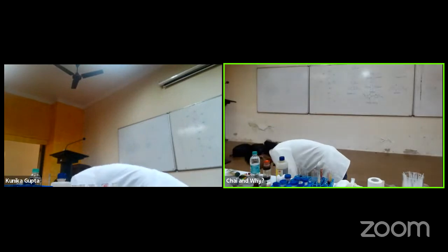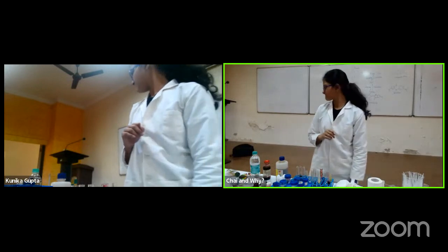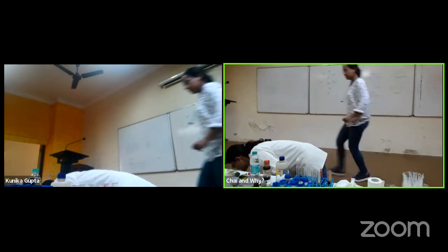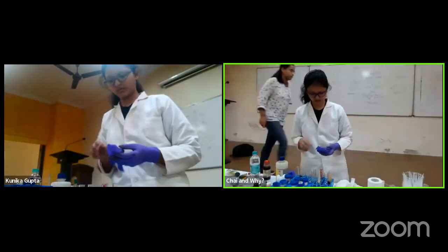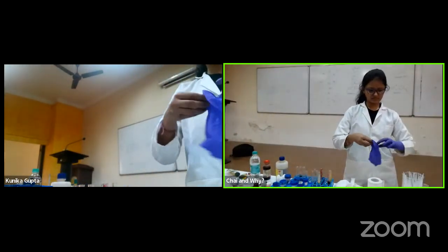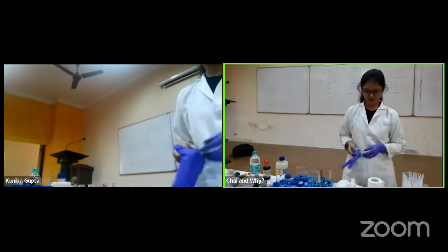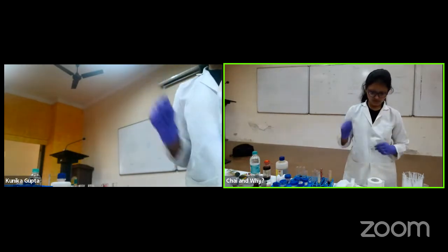You need new gloves. Gloves. Gloves. This thing again, I should.